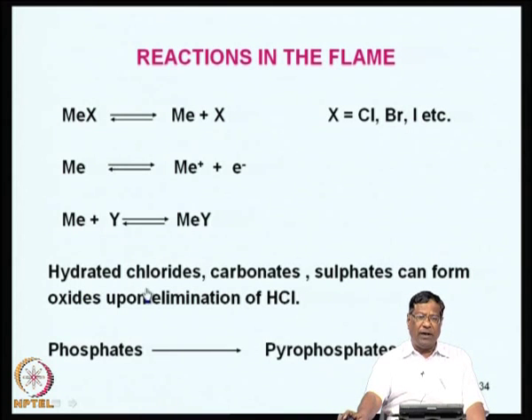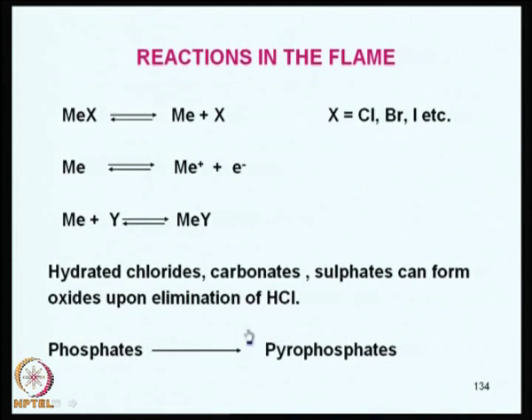It can decompose and react with oxygen and form carbonates, oxides, etc. And phosphates can form pyrophosphates. That is also another possibility.